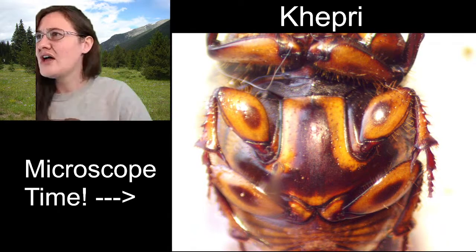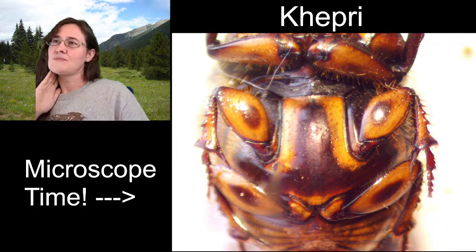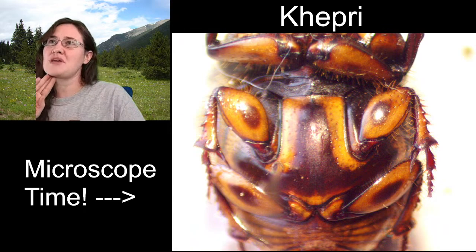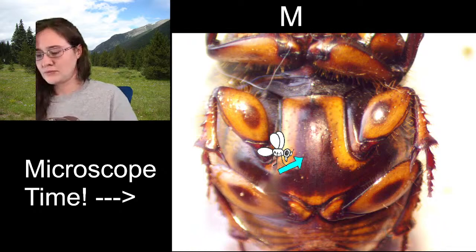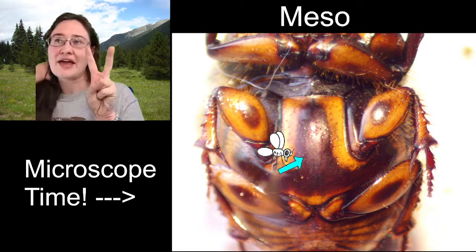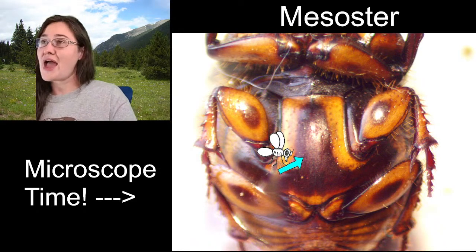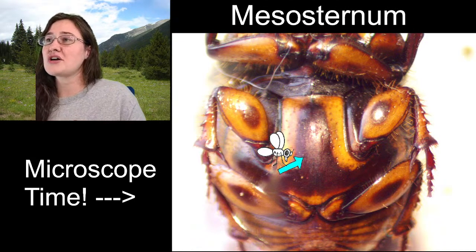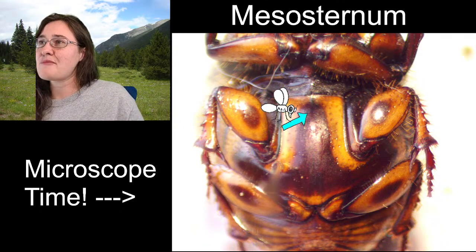All right, so now that we are looking at this, what would we call this? We would call this section the mesosternum, if you want a new word. Meso meaning middle, or referring to the second segment of the thorax. Notum means the top, and sternum means the bottom. So when you say mesosternum, you are talking about this big plate here on the bottom of our beetle.